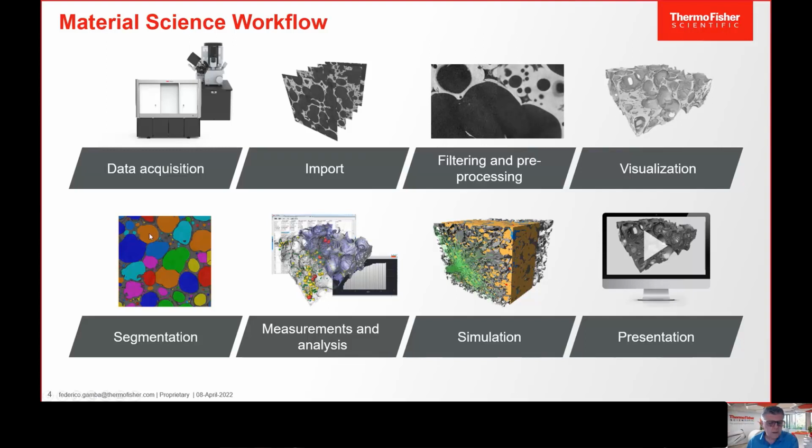And you may first just assign pixels to one generic phase, like pore space, and then eventually you may want to measure each individual pore. So you're going to split them into each entity, and then you are going to measure, for example, the equivalent diameter, the volume, the length, the ratio of length and width, and things like that. And so you can start to prepare tables out of it, and maybe histograms and charting and so on.